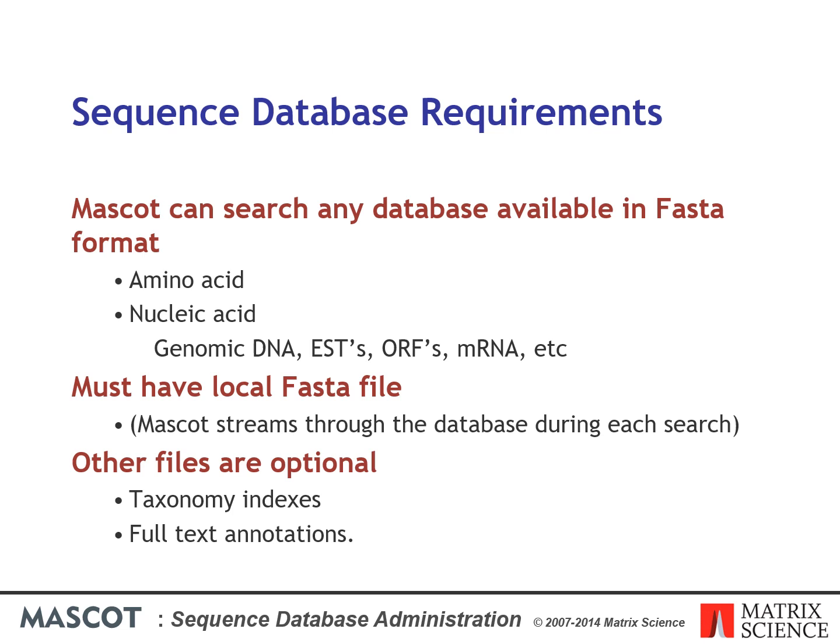If the database contains entries from multiple organisms and you want to be able to filter searches by taxonomy, then this will require some additional files which vary from database to database. And some databases such as Swissprot also come with full text files containing comprehensive annotations.